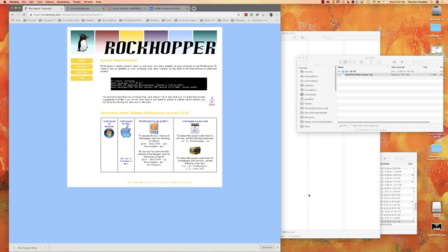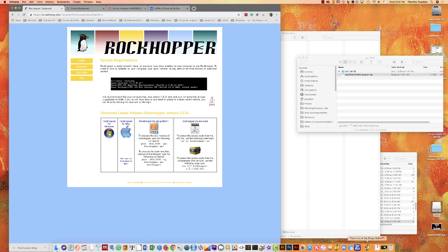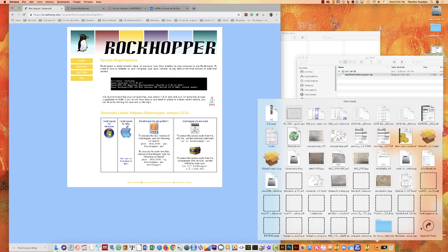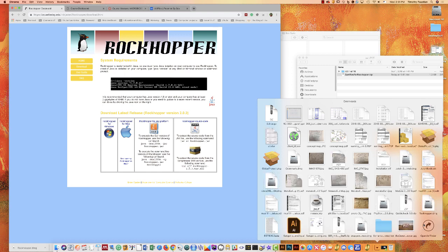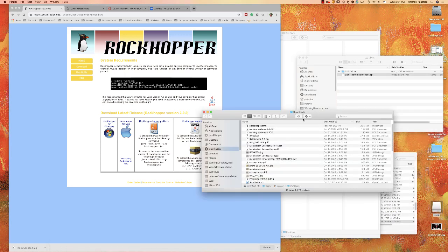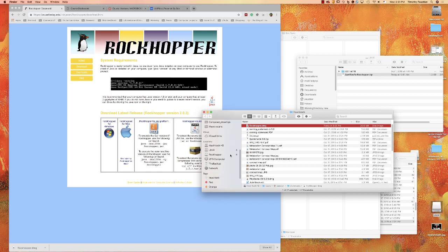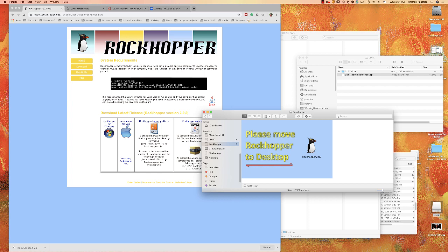Now that we've got RockHopper downloaded, the next thing we need to do is expand it. It's going to come down into your downloads folder. Go in there and what you're looking for is RockHopper DMG. So you double-click on that, and it will launch and scan through it, and then see that it's okay to use and expand onto your folder. It's now expanding this disk, and I have a little thing called RockHopper.